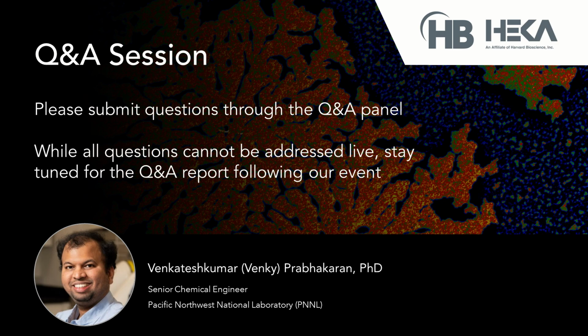But in corrosion applications, like I mentioned before, if you use a salt solution, it evaporates quickly if you use a small tip. So you need to go for a little bit larger diameter tip, typically in the 3 to 7 micron range.